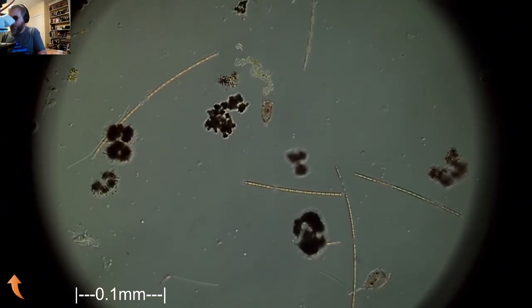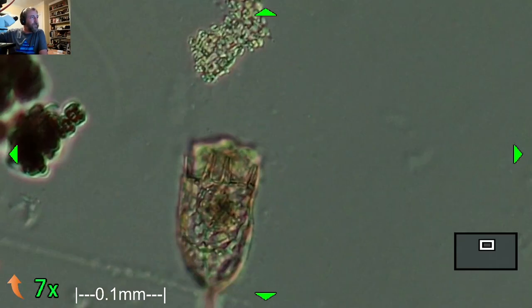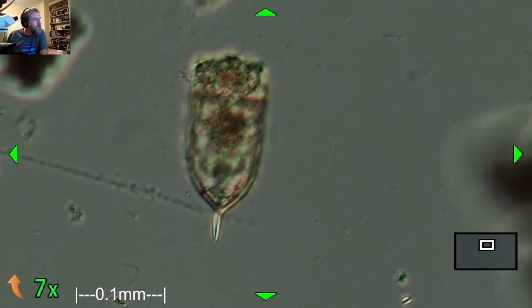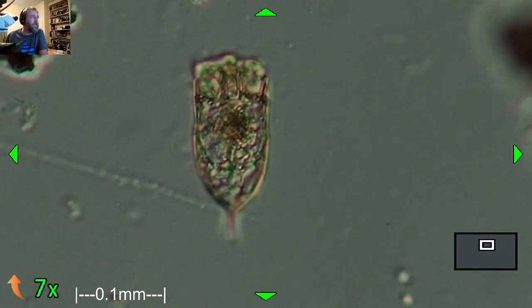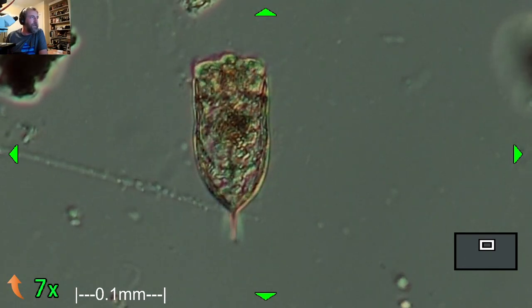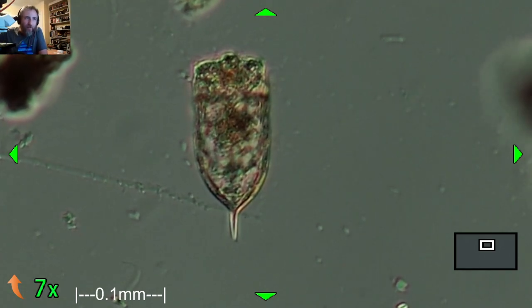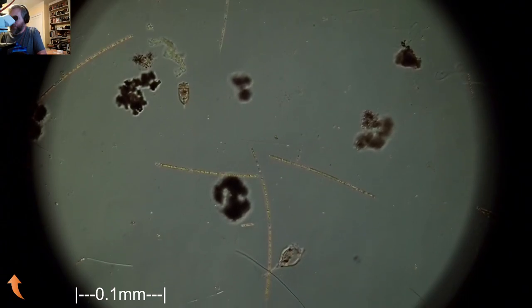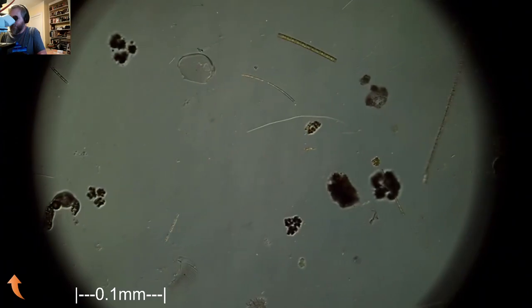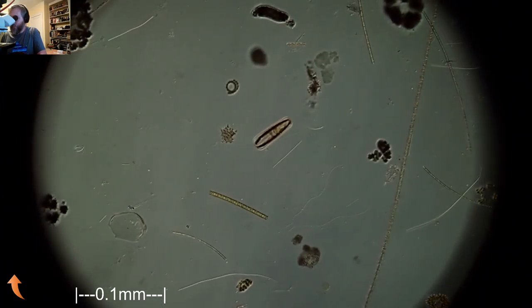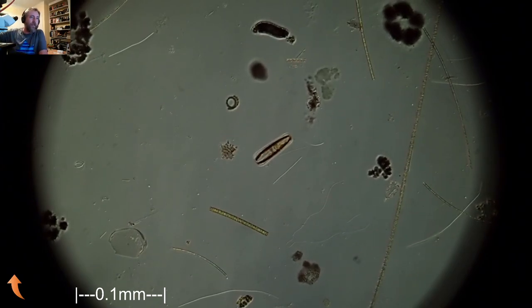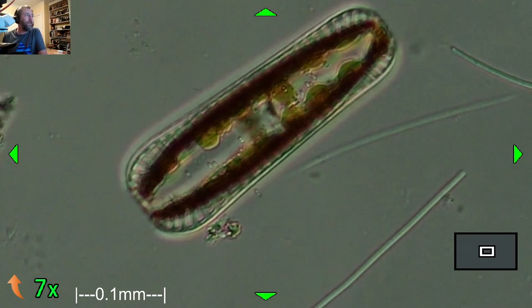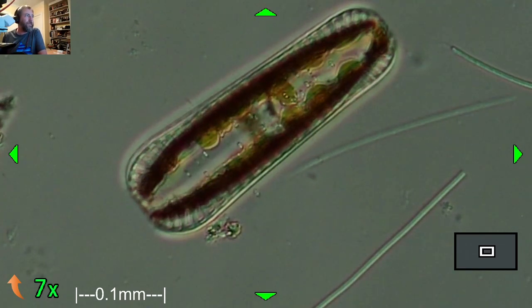Oh, there's a tintinid. Yeah. Right there. A little freshwater tintinid. You can still see its little lorica. Oh, is it a tintinid? I think it is. Maybe it's a rotifer, actually. Not positive. I think it's a rotifer. Algae is edible for a lot of organisms. But that doesn't mean you should eat it. You know. Might not be the best thing for you. And that's another giant diatom right there. That's a Cyrella. A big one. You can still see all the chloroplasts. Seems like it's doing okay.